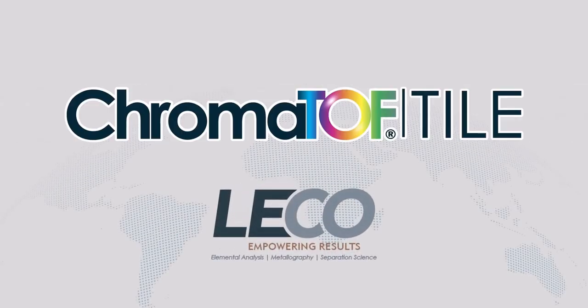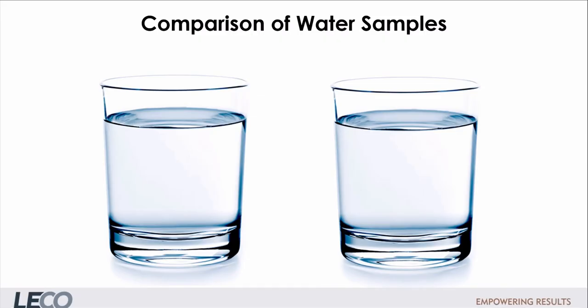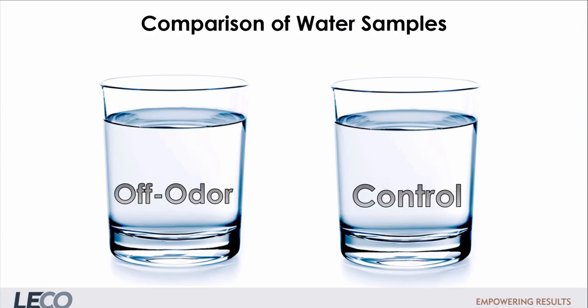LECO's ChromaTOF Tile can streamline data analysis and quickly find differences between GCGC samples. Here we are highlighting an application project where we used ChromaTOF Tile to compare two water samples, one that had an off odor and a control sample that didn't.